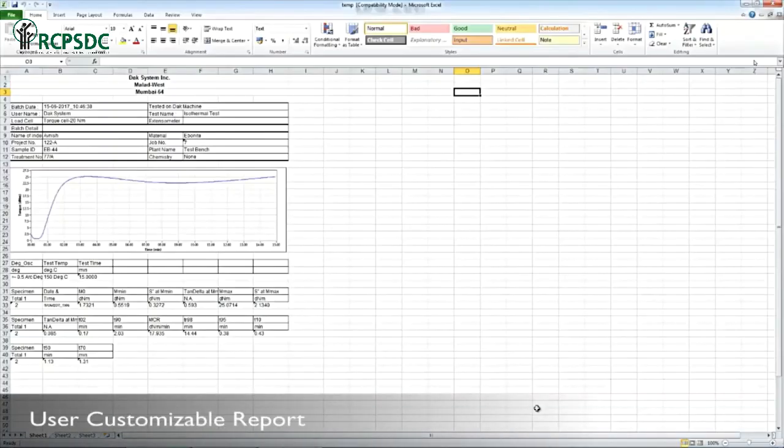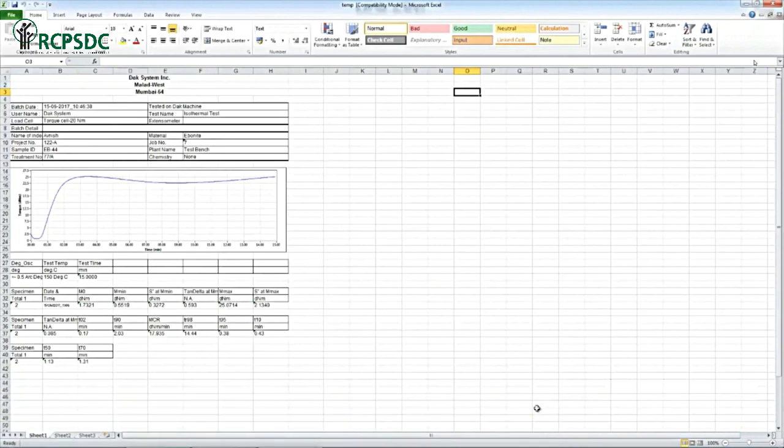After completion of the test, a test report will be generated with a rheometric curve, which is a fingerprint of compounds' curing and processing behavior. Parameters like ML, MH, TS2 and T90 will also be mentioned in the report.